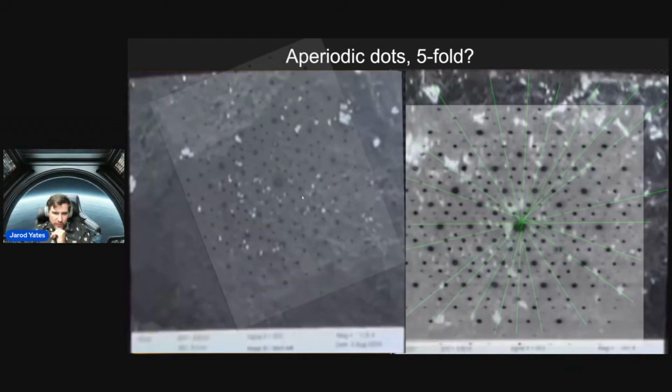So here's five-fold symmetry. These black dots are five-fold symmetric quasicrystals that I'm just overlaying on top of these to try to see how well they overlap. And I'll admit, it's not even close to a perfect one-to-one. I'd say at best we're probably sitting around 50% correlation from what I'm able to see between these two.